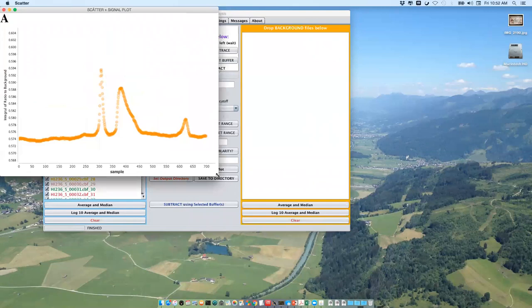What is very useful for us, if you really want help with the data processing and merging, is to tell us what it is in a sample. You don't need to tell the exact name, but tell us if it's a complex, or a DNA-protein, or RNA, or protein-protein complex. So this is, I think, I'm not really sure exactly now, a protein-RNA complex. And it's a weak one. With the additional information I got, it has a lower affinity. So we're also expecting some separation of complex and non-complex state.